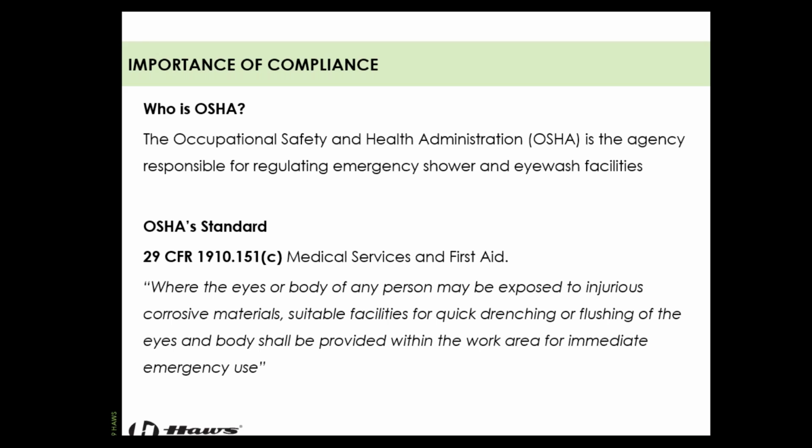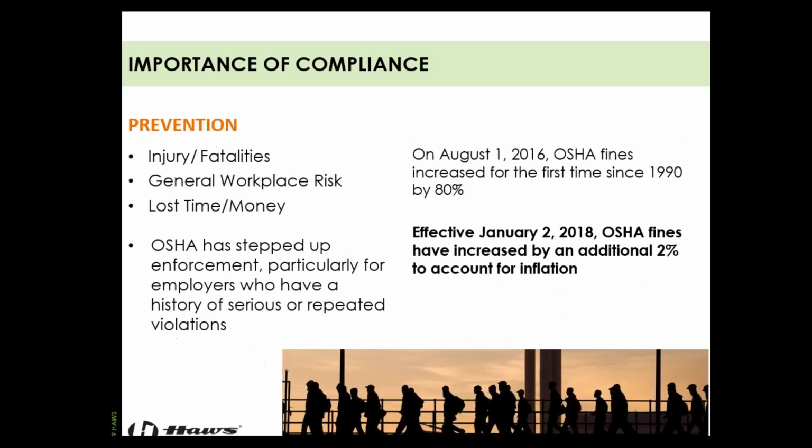And they use the ANSI standard as the primary source for compliance with 29 CFR 1910.151(c), because they don't give us the how, where, when, etc. These are the kind of questions that come up frequently. How do we accomplish this? How do we stay compliant?